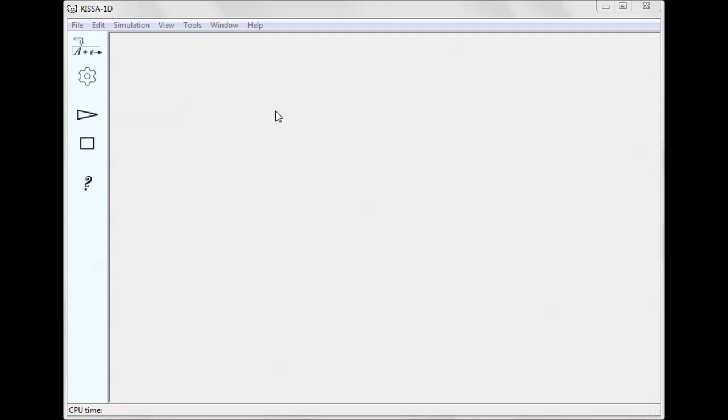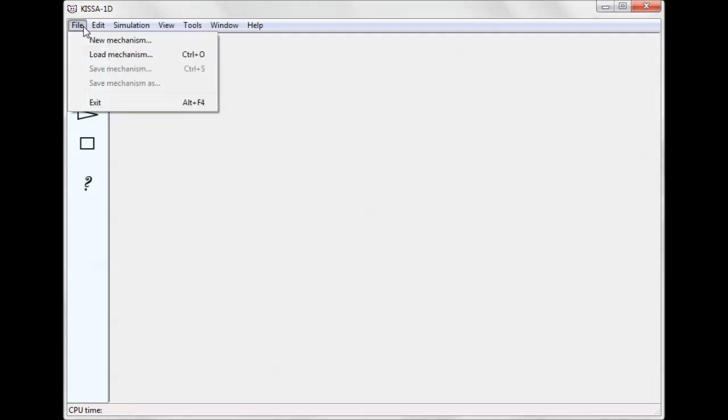Let us consider a sample reaction mechanism supplied together with KISA-1D, which can be loaded from the program folder using the Load Mechanism button on the tool panel or through File Load Mechanism menu.